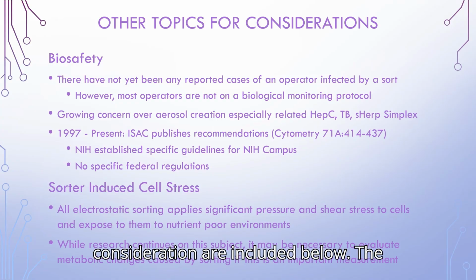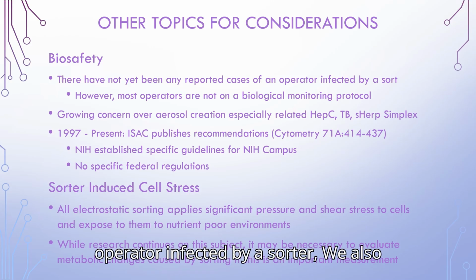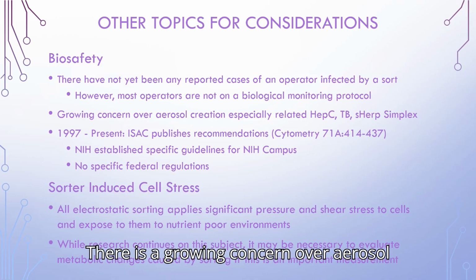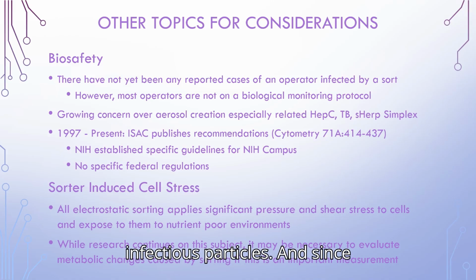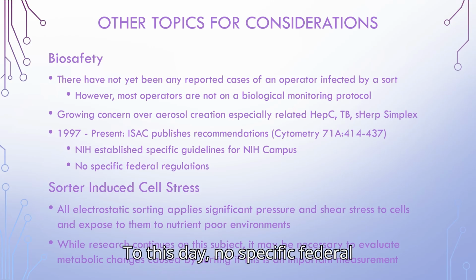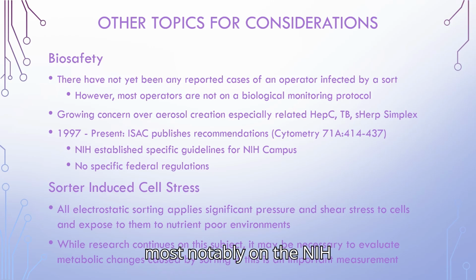Some other relevant topics for consideration are included below. The first is biosafety, and while there have not been any reported cases of an operator infected by a sorter, we also know that most operators are not on rigorous biological monitoring protocols. There is a growing concern over aerosol creation, especially related to infectious particles. And since 1997, when ISAC published the recommendations for biosafety, this society has encouraged all operators and users to follow these guidelines to maintain a safe environment for everyone in the proximity of a cell sorter. To this day, no specific federal regulations exist, but there are established rules on certain campuses, most notably on the NIH campus, where there are guidelines for biosafety related to cell sorters.